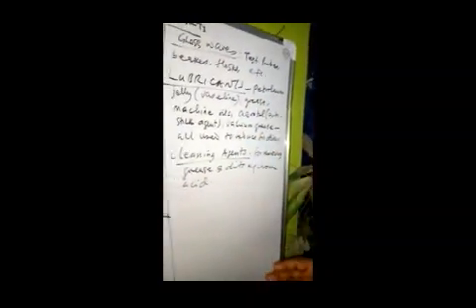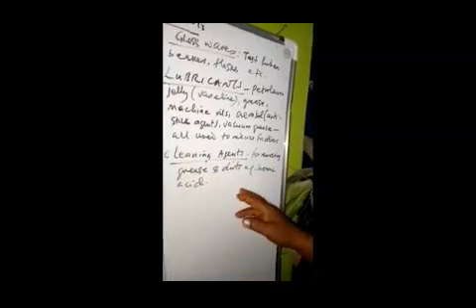Then cleaning agents. How do you remove these lubricants? You can remove this lubricant, especially grease and dirt, by using chromic acid. By using what? Chromic acid. We continue this lecture in part 2, and we are going to deal with mixtures and separation of mixtures in the laboratory.